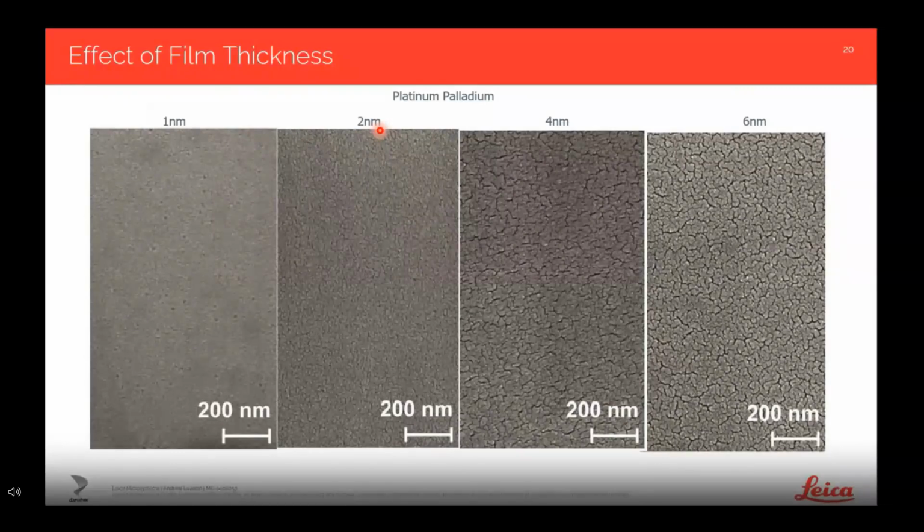If we have a lower resolution imaging need, but we have a highly topographic sample, like a full insect, for example, 1 or 2 nanometers typically won't be enough to completely reduce the charging that might occur. You won't get full coating on all those topographic surfaces typically.